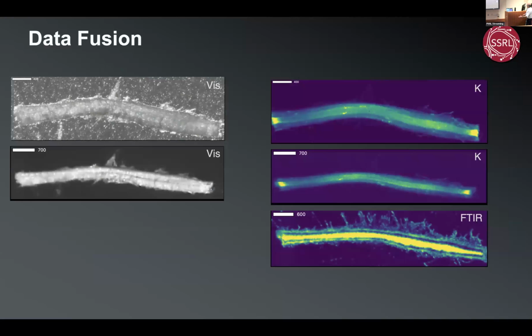But then, this is actually an interesting challenge too. This shows that stem again. And Jocelyn even hinted at the fact that there were some slightly different methods in between the infrared and the visible, but you can still see the visible data looks good. That's also the visible data from the other beamline. You can see that things have changed even between beamline 7 and beamline 14, and definitely from the infrared.